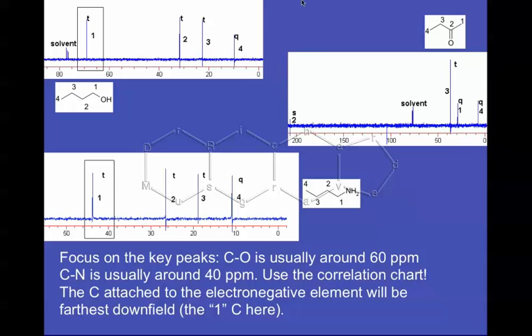After we've differentiated them and assigned the compounds to the spectra, we can then assign each peak to the numbered peaks in the compounds. Now the way this works is, like I said before, the peaks that are closest to the electronegative atoms will be furthest downfield, and then as we get further away from the electronegative atom, the ppm values for those peaks will decrease.